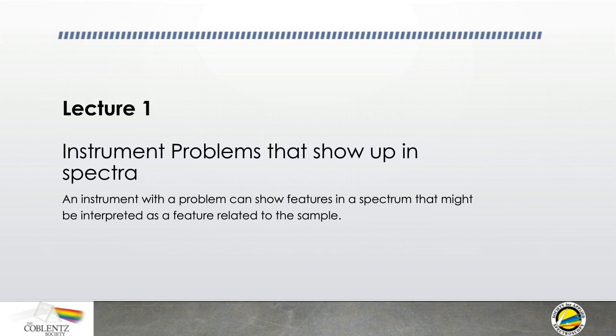Things that you will see in the spectrum that are actually due to an instrument not performing.